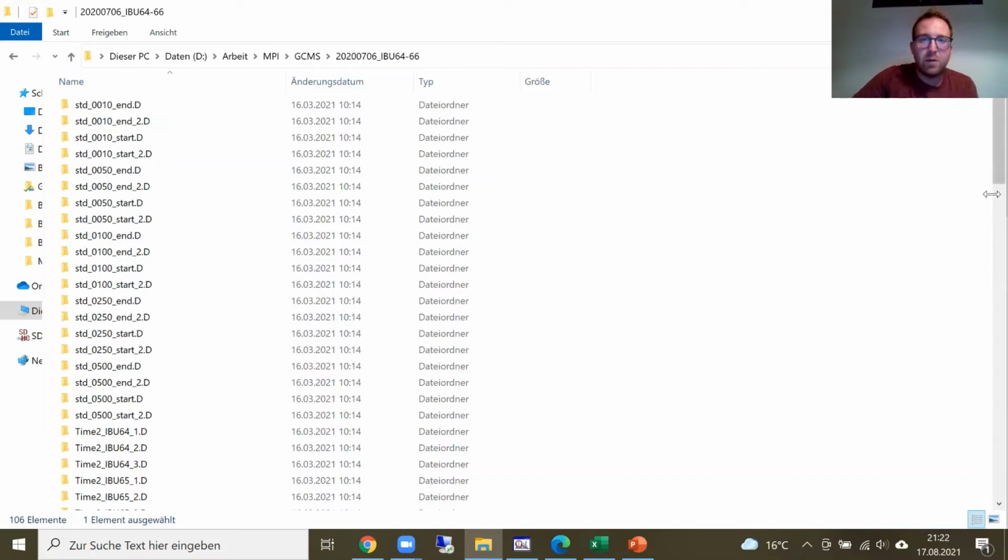The nice thing about isobutanol is that it's a volatile compound and can be directly quantified from the culture broth by a GCMS, by headspace injection. Thing is, in our lab, we only own one GCMS instrument and also only one MassHunter license for this instrument. So sometimes there's a little traffic jam in front of the machine because people want to analyze their data or want to generate new data.